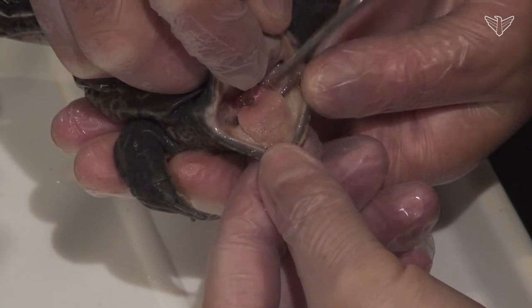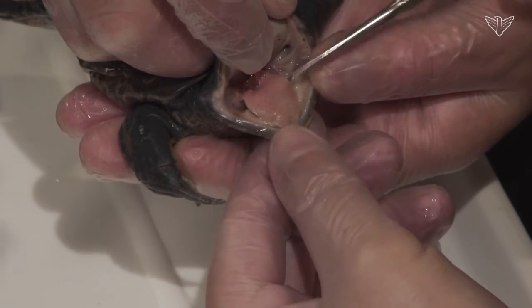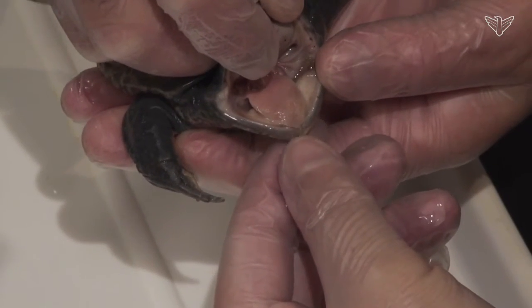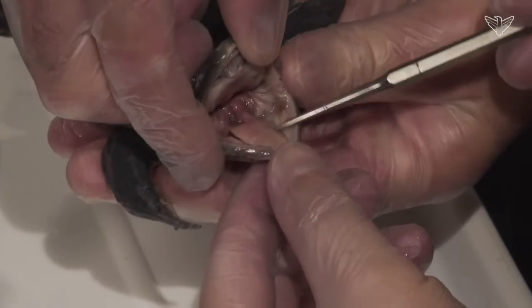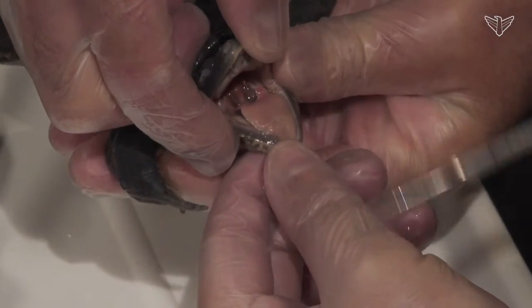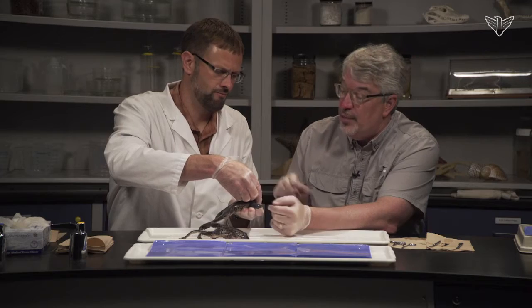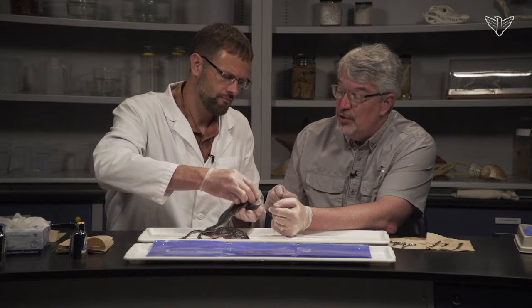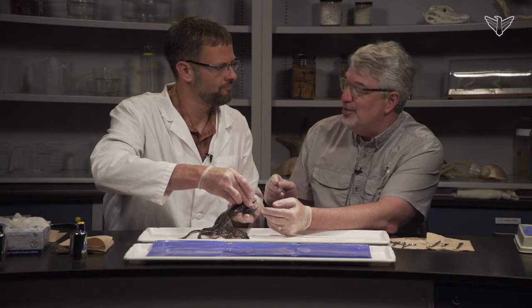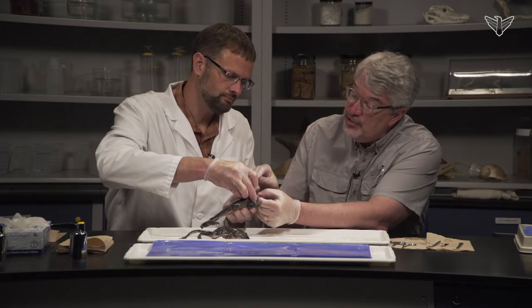And what's unusual about a frog tongue is you can see it's hinged here in front. It's the back that's loose. And so they basically project that tongue out of the mouth. In a living one, these preserved animals have shrunk up some, but that tongue would be able to push out with hydrostatic pressure and have a sticky end and catch an insect or whatever and pull it back in. So we often see that characterized in frogs, and it's true. Absolutely.